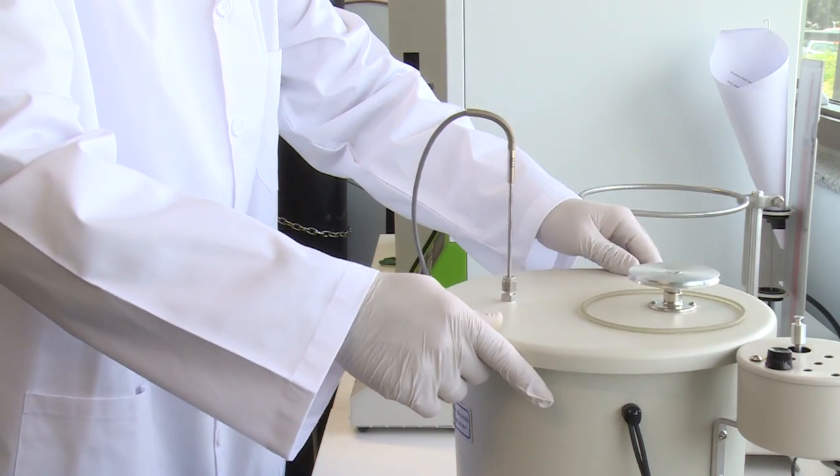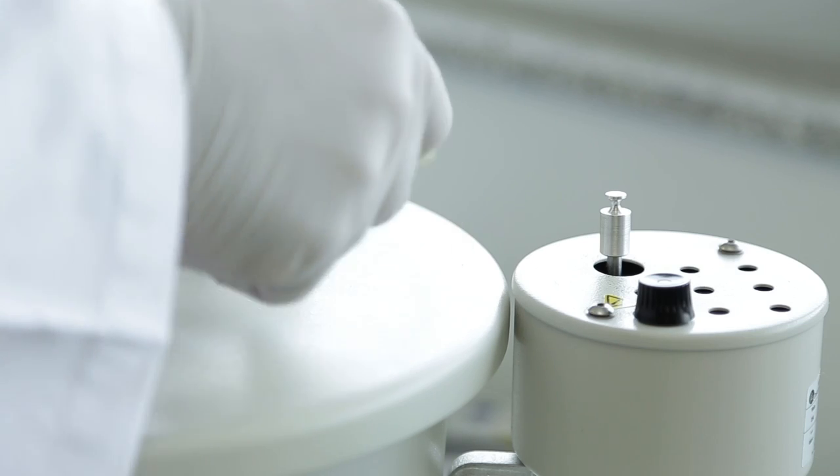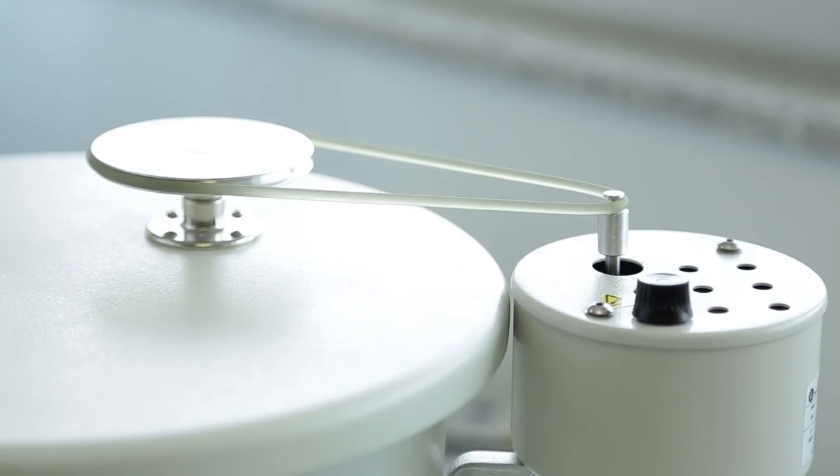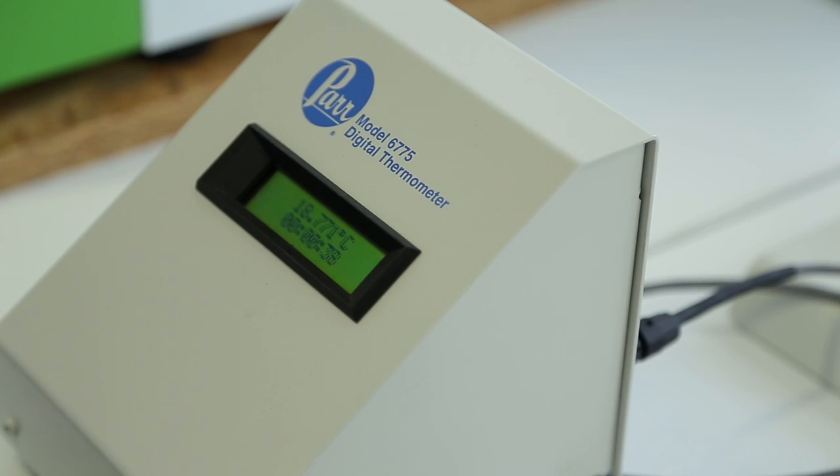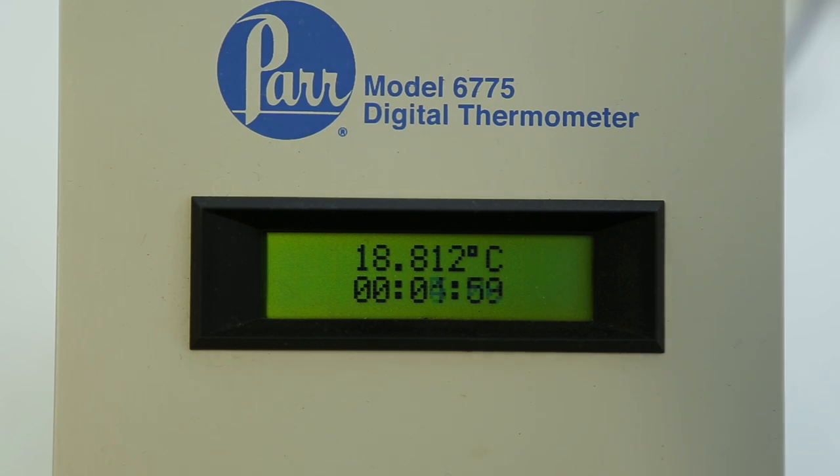Turn the stirrer by hand to be sure that it runs freely. Slip the drive belt onto the pulleys and start the motor. Turn on the digital thermometer. Let the stirrer run for 5 minutes to reach equilibrium before starting a measured run.